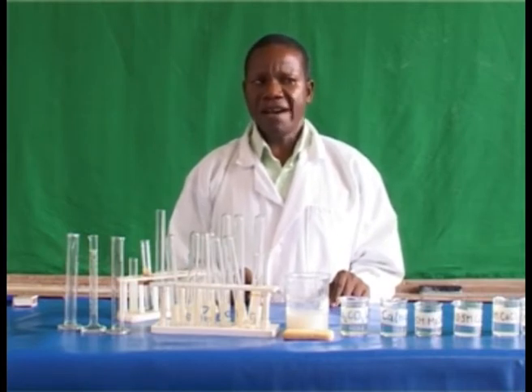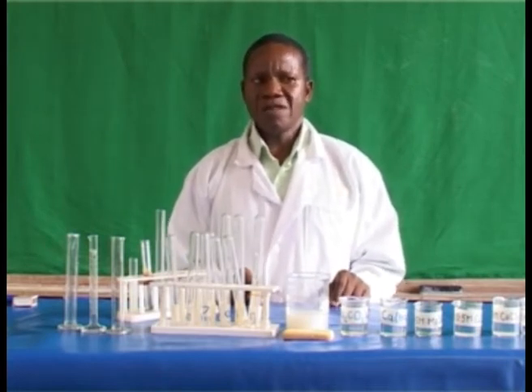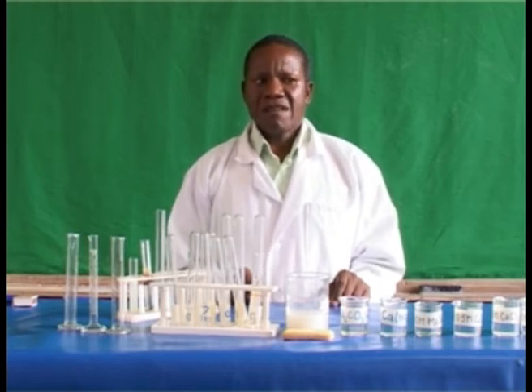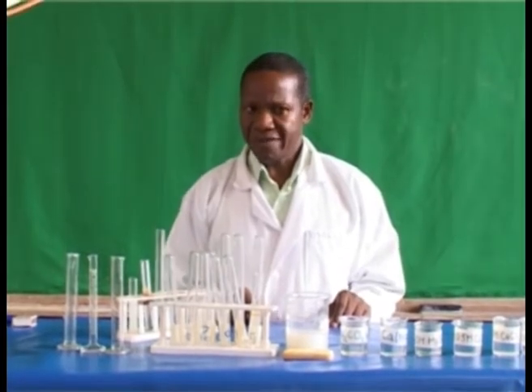Water is said to be hard if it contains dissolved salts of particular kinds. Since not all dissolved salts will make water hard, it is important to differentiate substances which cause water to be hard, since hard water may cause wastage of soap during washing of clothes. Aim of this experiment: to demonstrate the causes of hardness in water and how to remove it.